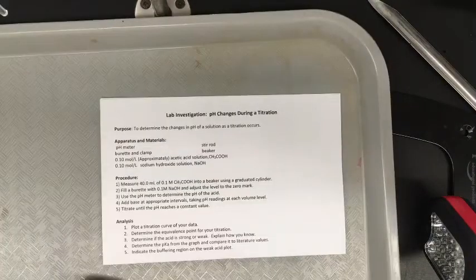So in this reaction, we are going to be titrating acetic acid, and in this example we're using 5% acetic acid, so it is asking for 0.1 molar acetic acid. So I will need to dilute our 0.83 molar acetic acid down first off.